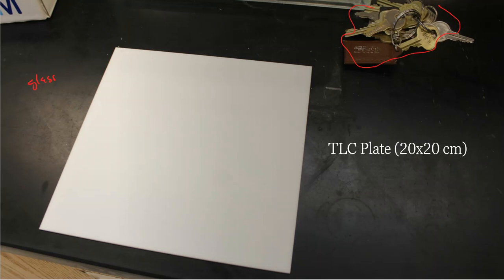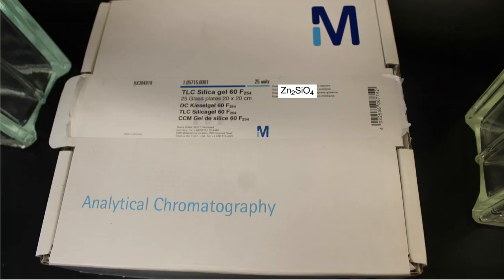On this surface, the white stuff that you're seeing on the plate is all SiO2, a very polar stationary phase applied to that plate. If you want to know the box they came from, here they are. Here are the TLC silica gel plates. Notice it gives the dimensions, 20 by 20 centimeter, and it also says that it has the F254 indicator on it. That F254 indicator is nothing more than a zinc silicate compound. They mix this in with the silica, then smear it onto the glass or plastic backing and let it dry, so the F254 is already in there.